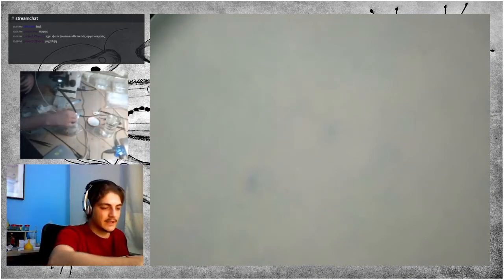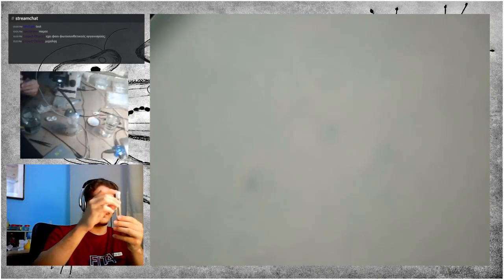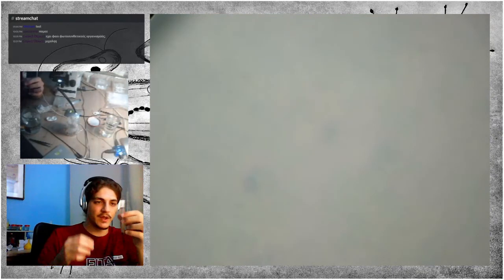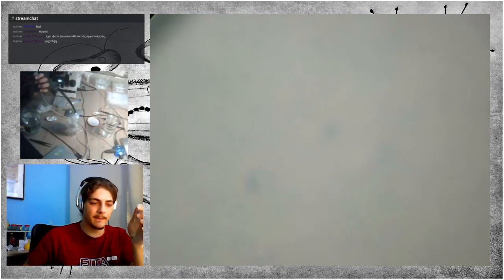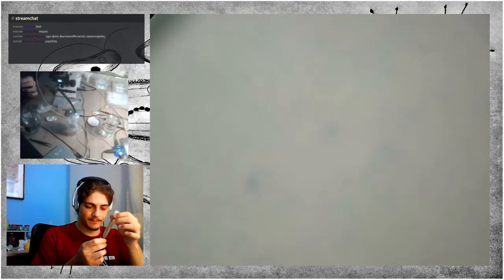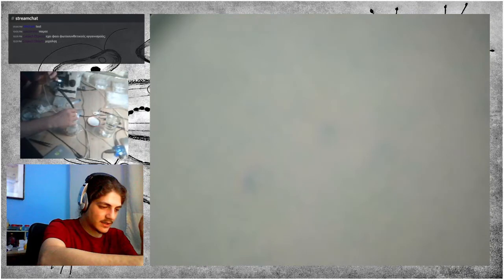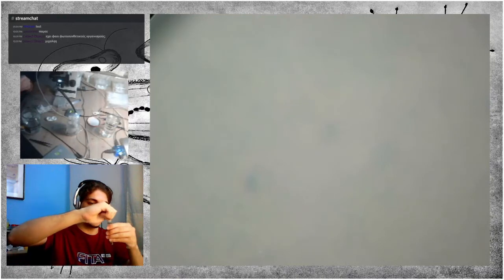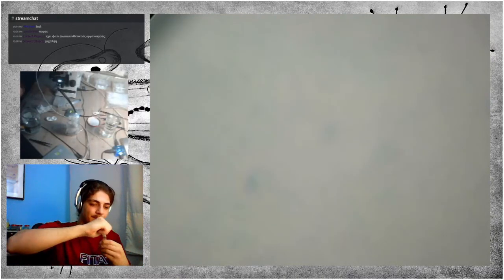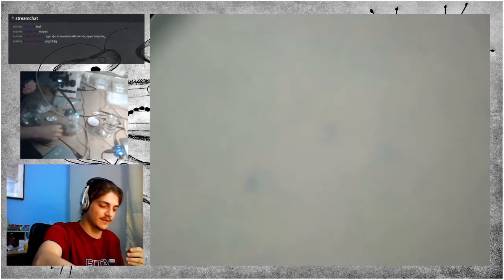Now, those vials contain water from a large water tank that I have with a huge sample of water from a small lake. Now this, I think, is part of the sediment, and I would like to observe this one, which contains biofilm that formed on top of the water, on the water surface.